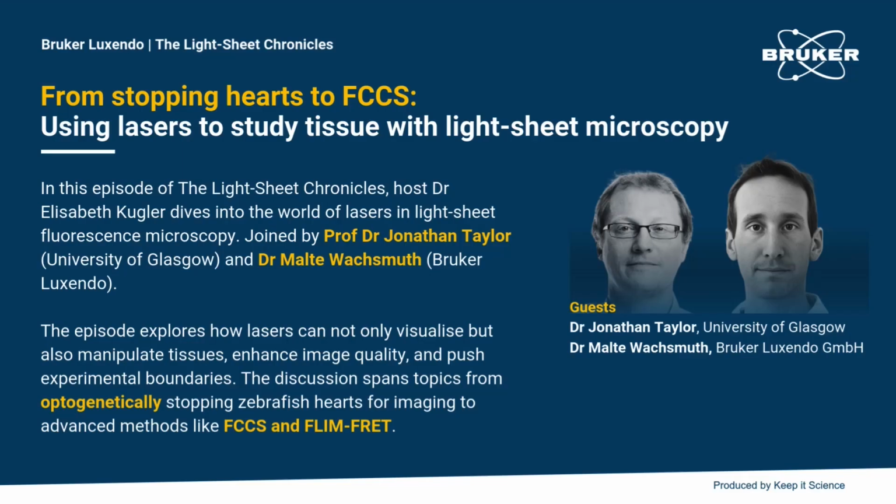Because we know FRAP, which is fluorescence recovery after photobleaching, we thought today we're going to take all of this a step further and skip FRAP a little bit and dive directly into FCCS, which is fluorescence cross-correlation spectroscopy. This is something that is significantly less used in many labs and also probably less known. So Malte, can you maybe speak to our listeners, what is FCCS and why is it so amazing to have in different labs?